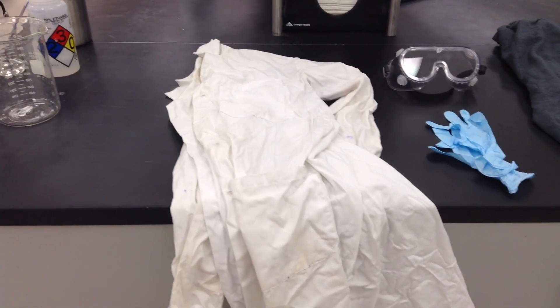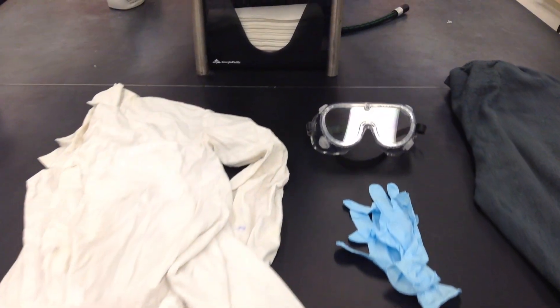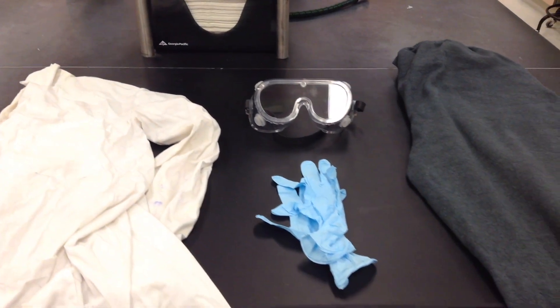Upon coming to the second day of lab, you must have with you personal protective equipment, or PPE. This includes a lab coat, goggles, gloves, long pants, and closed toe shoes.